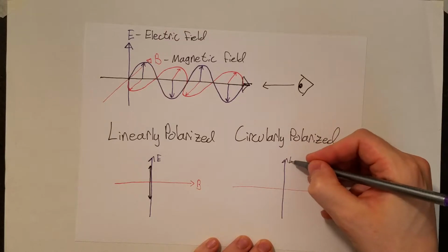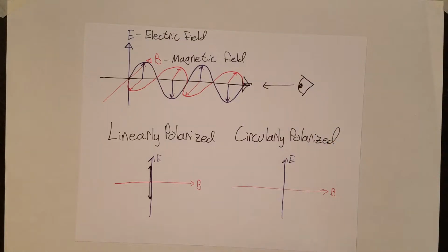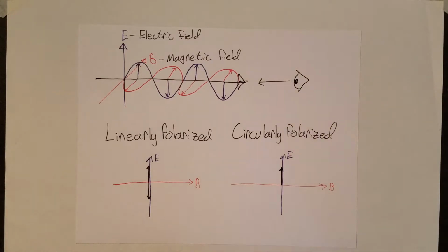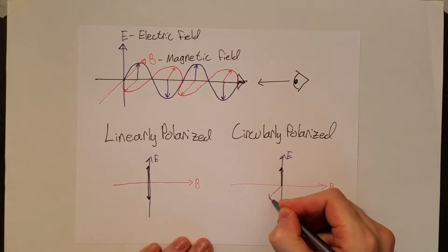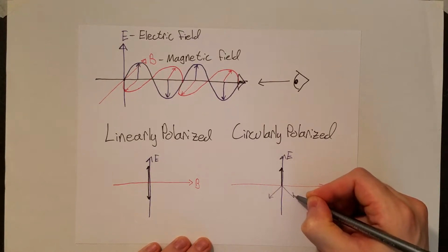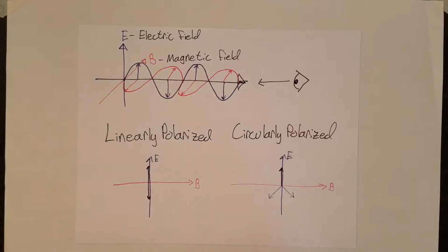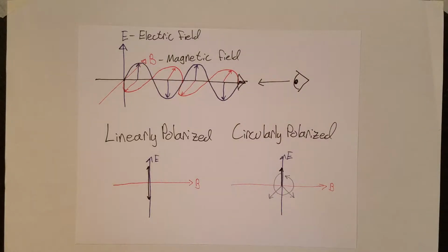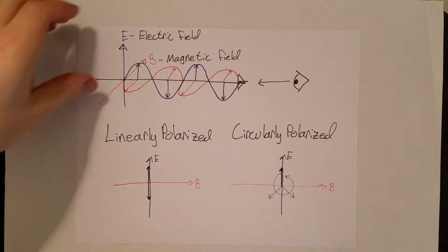Circular polarization is a bit more complicated. Briefly, instead of the polarization direction remaining in one direction, the vector that describes the electric field rotates around a circle in a clockwise or counterclockwise direction. What's interesting about this type of polarization is that it does not change with rotation. As I rotate the page, the direction of polarization is still counterclockwise.